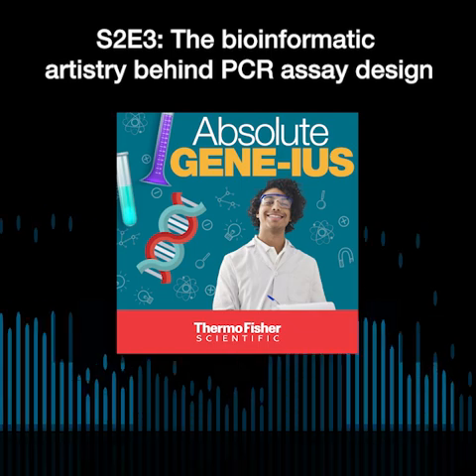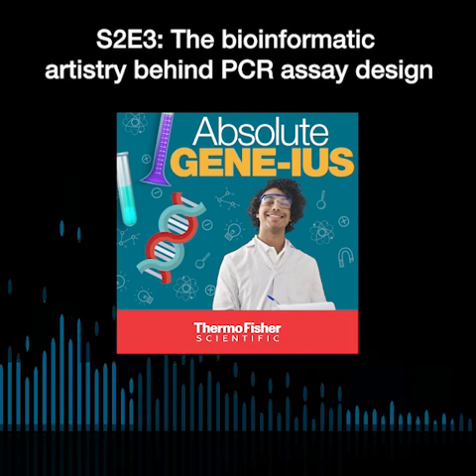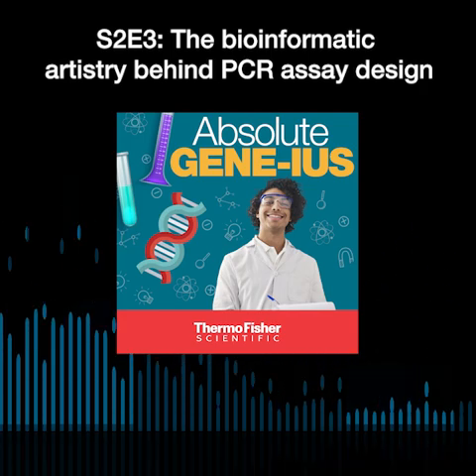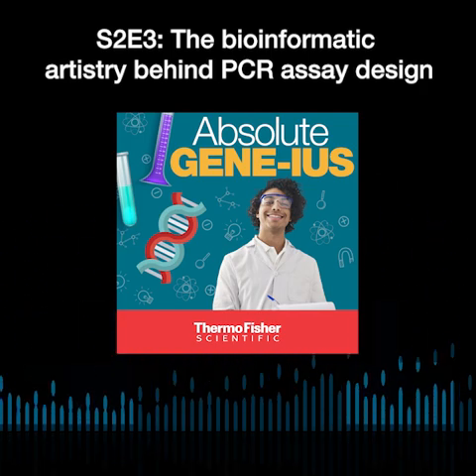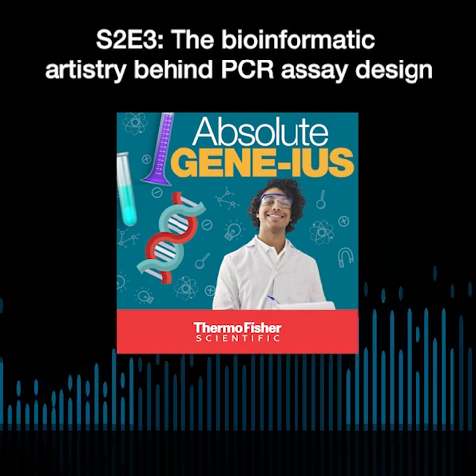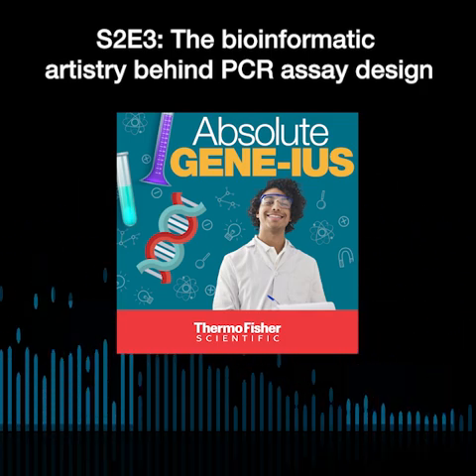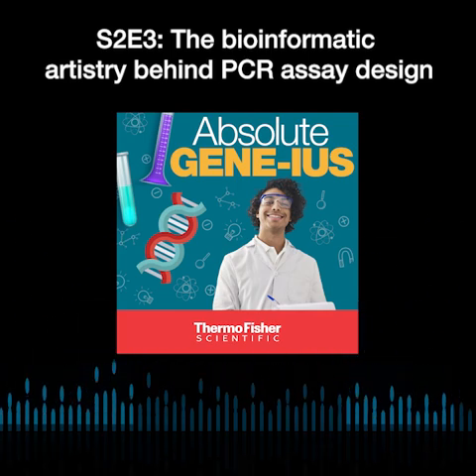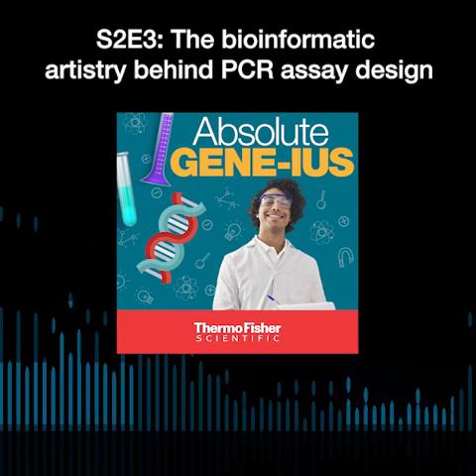And sometimes you find little surprises along the way. Sometimes they request a target in a region and it's like, wow, there are pseudogenes in this region. So you have to figure out how to design it so that you're not amplifying the pseudogene, or maybe it's in a high GC region and you have to play with parameters to make it work so that you can design an assay in this region.